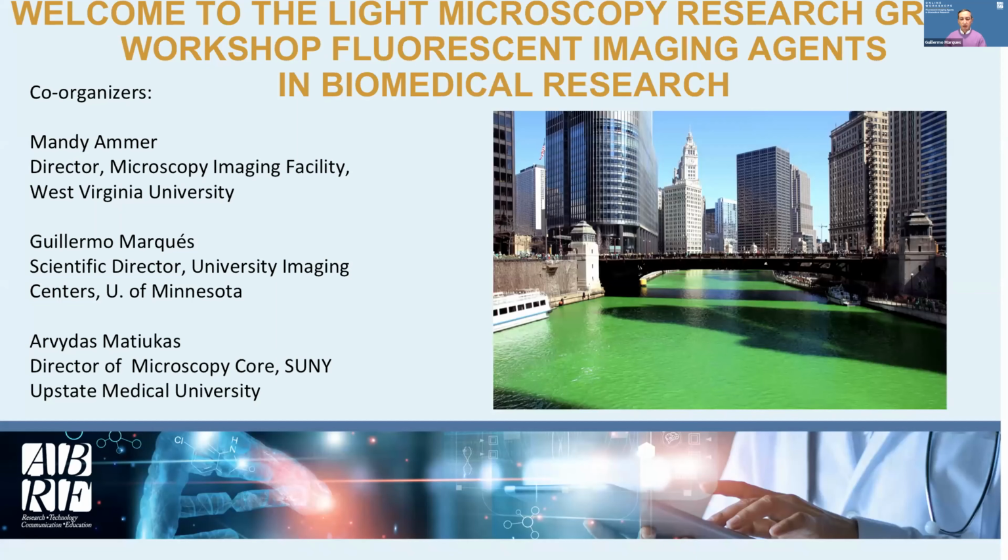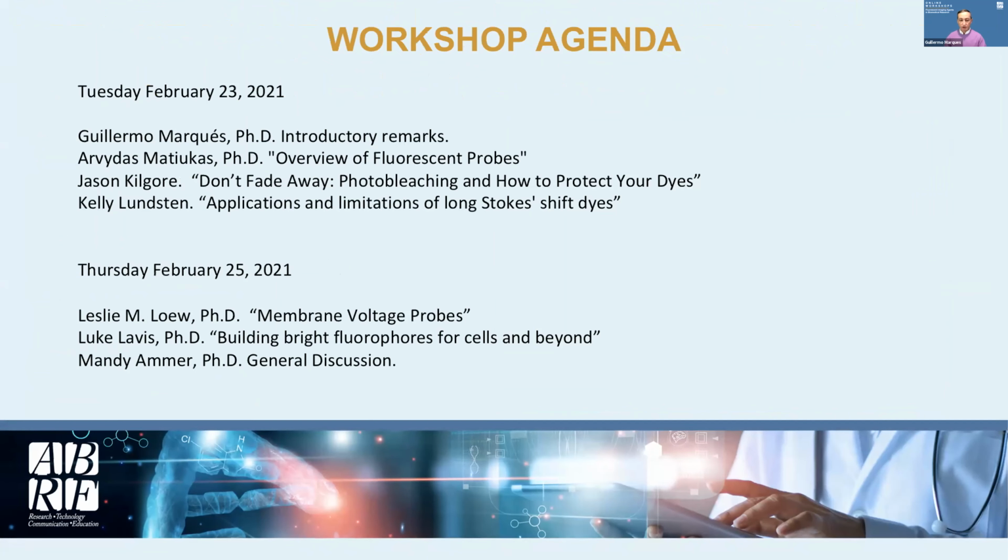Dyes are being produced on a continuous basis that are brighter, more stable. They have specific properties that make them serve as not only beacons, but also sensors of the physiological status of the cells. And those will be dealt with during this workshop.